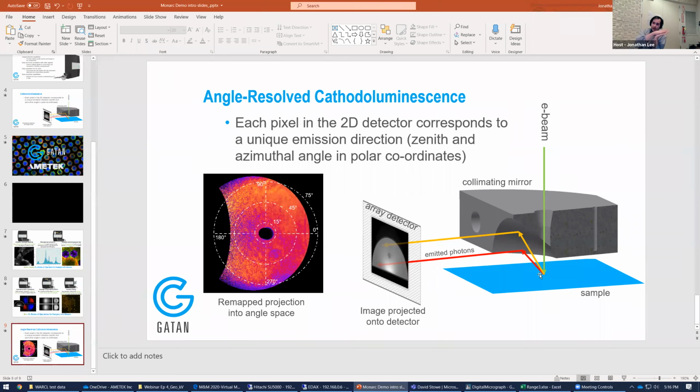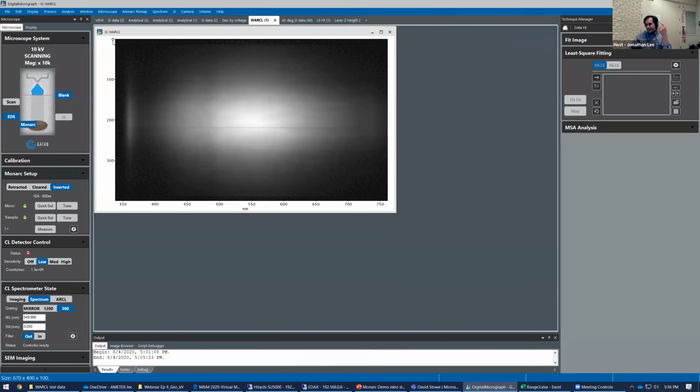Then we disperse that. So in one direction, it's coded angular information. It's not something that can be easily decoded, and it's not constant in either angle, and it's not linear in either angle. So it's challenging to say what this axis is. Pseudo angle is the best name for it.